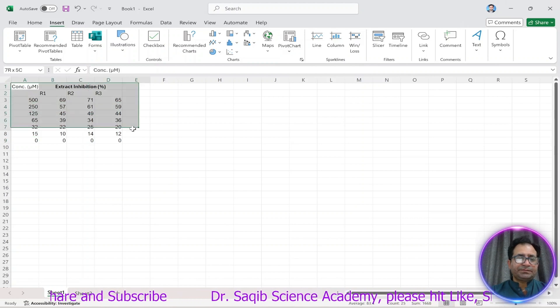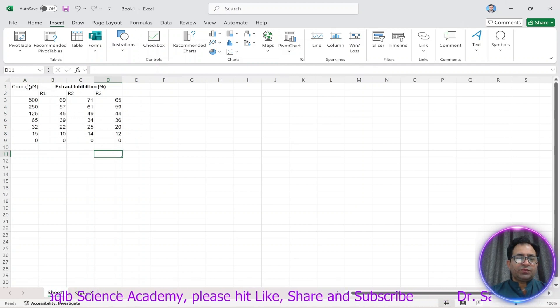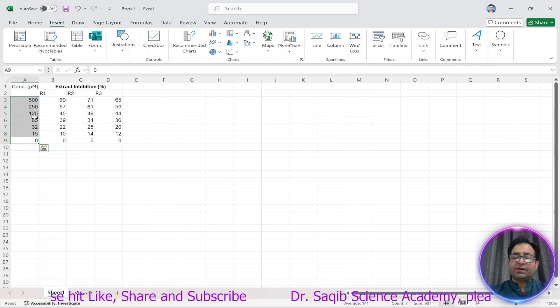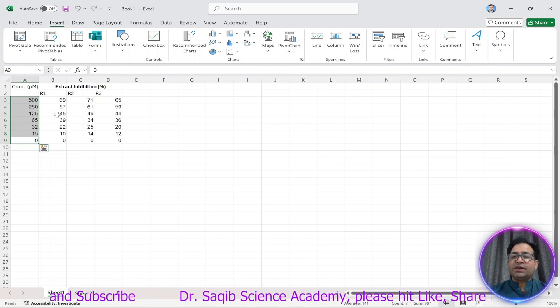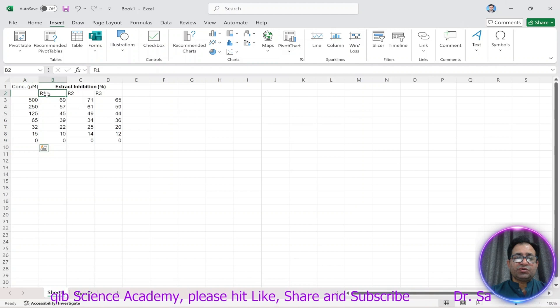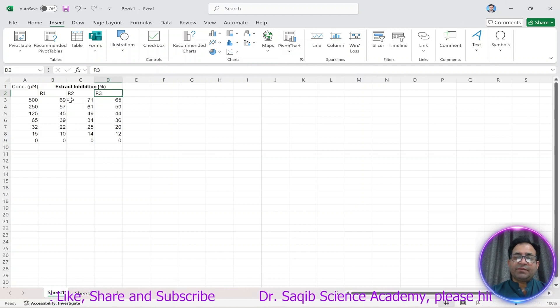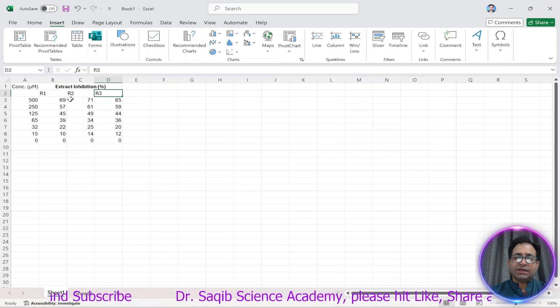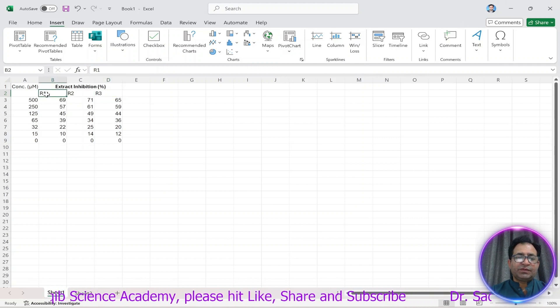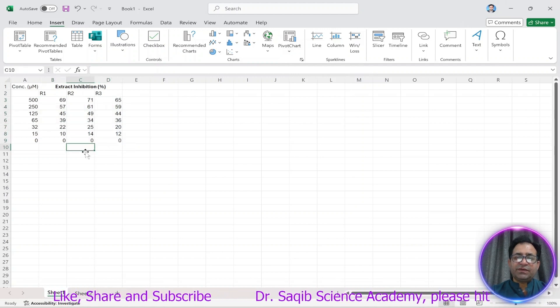In this data we used a plant extract whose concentration ranged from 15 up to 500. We used these concentrations to check how much inhibition occurs. The inhibition of the plant extract is shown across three replicates: R1, R2, and R3. Replication is recommended so that experimental errors can be removed. These are the three replicates and this is the percent inhibition.